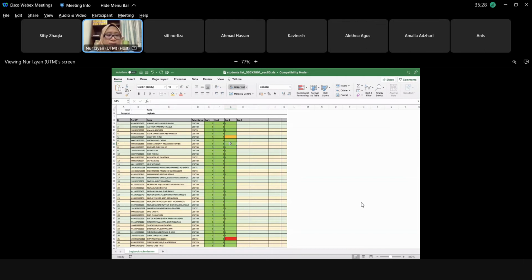Krista, are you here? Okay, Krista. How many standards? Five standards. Okay, thank you, Krista.